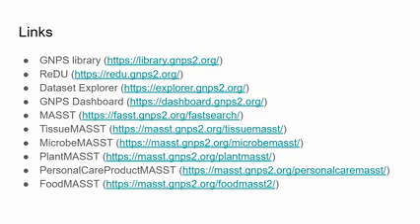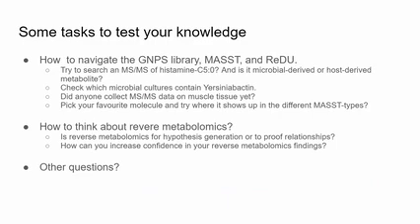Like I said, today it's still heavy with the code, but when you get used to it, it's a matter of 2-3 minutes, and then you get the whole process and the whole picture, and you can reveal much more information about all those different molecules than you've ever done before. If you're interested, we have some different molecules and different questions that you can address. There's a lot of time remaining, maybe 20 to 25 minutes. So if you want to play with it, we have some questions here, and we can also help you fix any of the remaining problems.